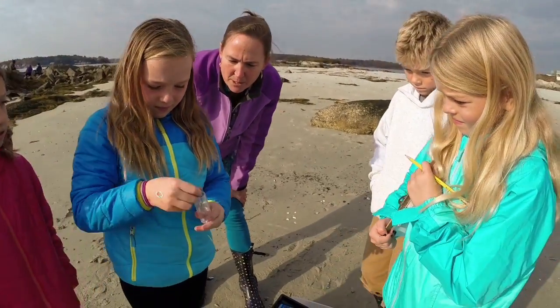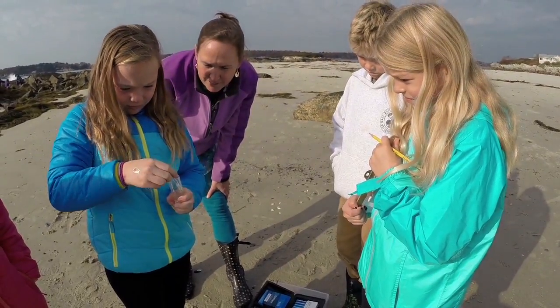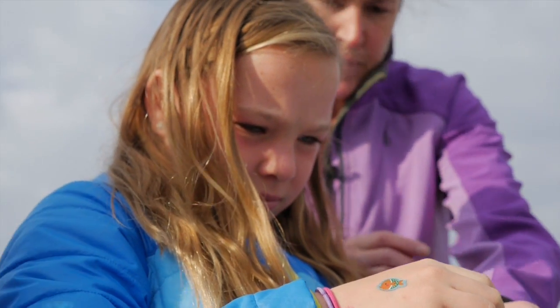So you're going to snap the bottom just a little, not too much. Let it fill up. Let's see.